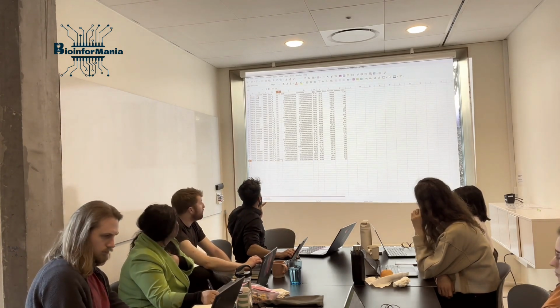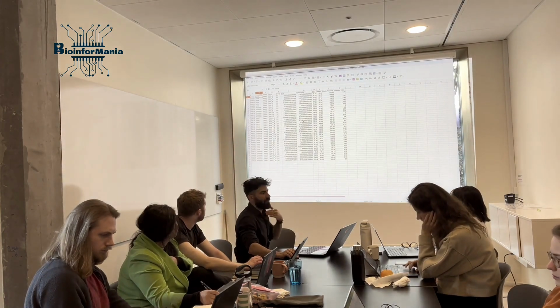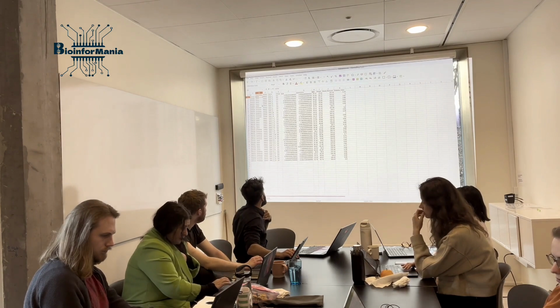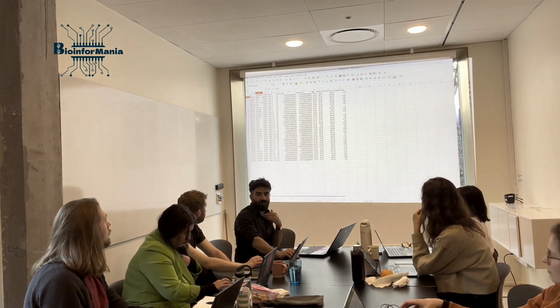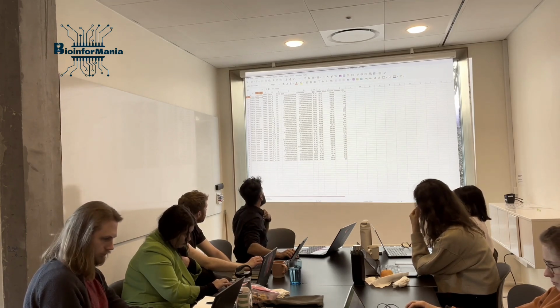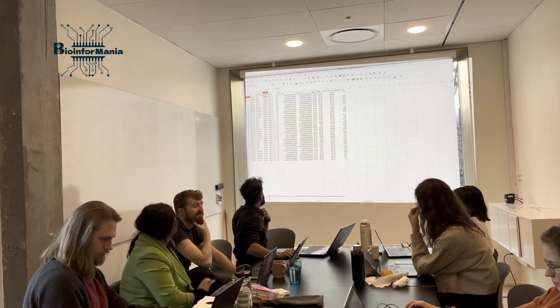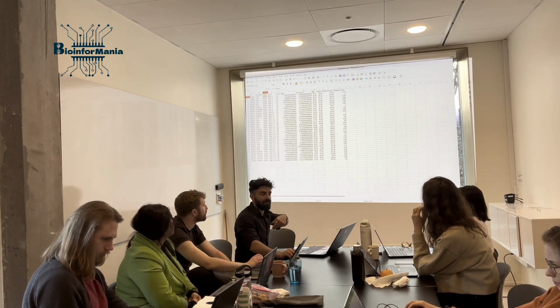And then here, these are all the information that I have about my study. For example, in my treatment, I have one group which is called naive or control group. Another treatment, we have given them protozoa. This study is a case for inflammatory bowel disease. In the weeks, we also have week 0. In it, the treatment is confounded, is nested.